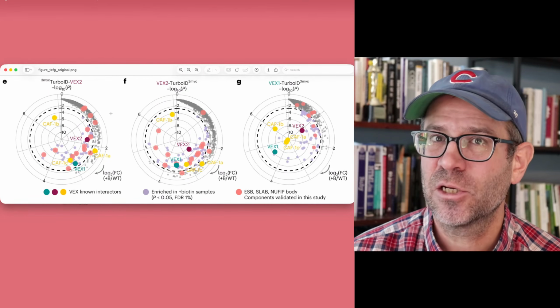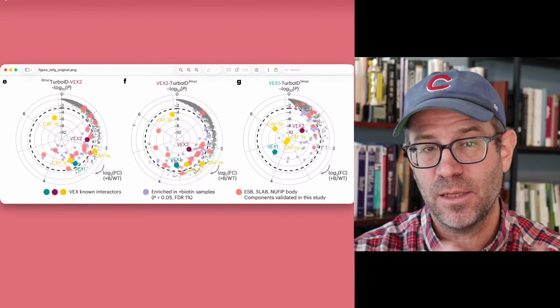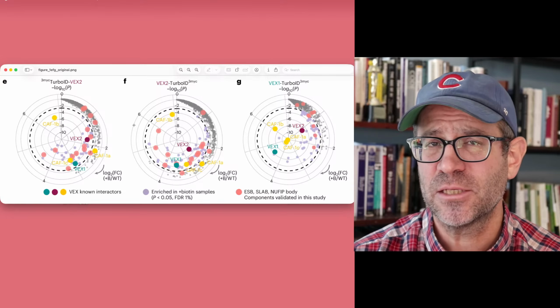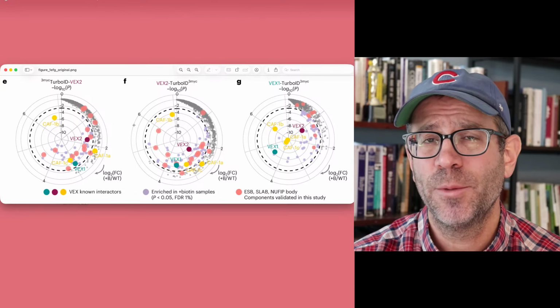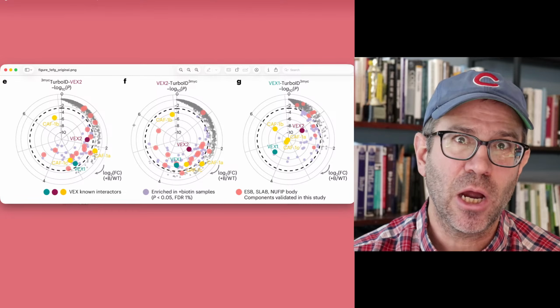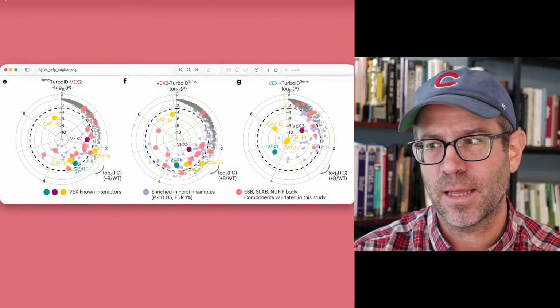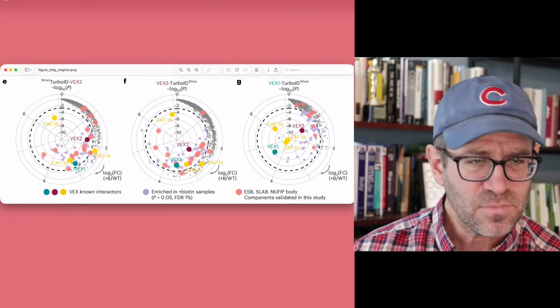but instead of drawing it in Cartesian coordinates, where on the x-axis you would have the log fold change in base 2, and the y-axis would be the p-value in log 10, they put it into radial coordinates, making them circles like this, right?